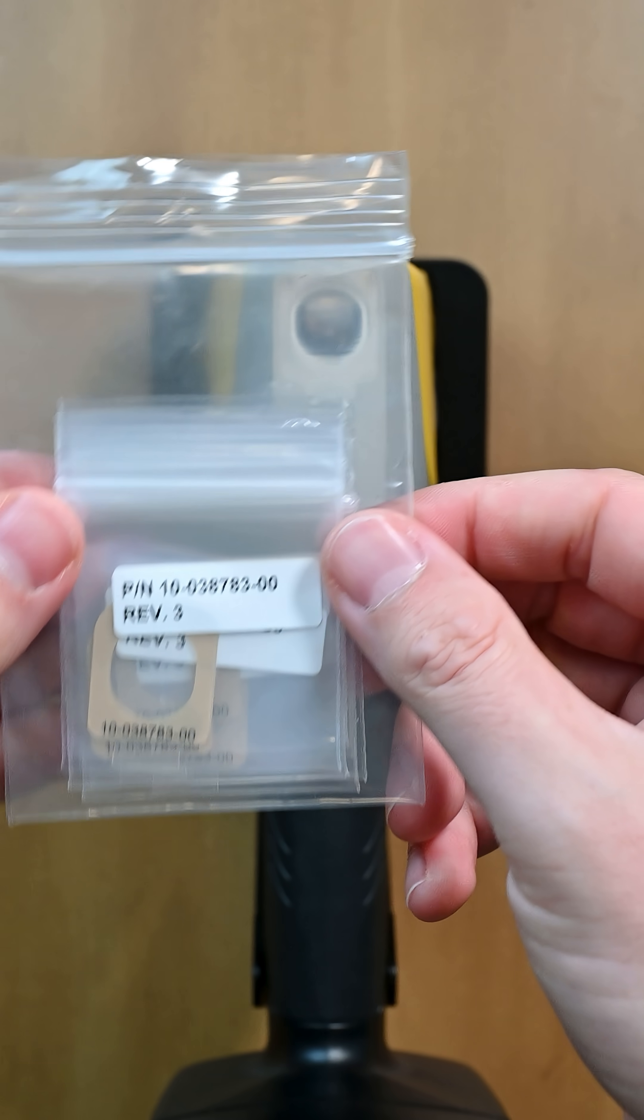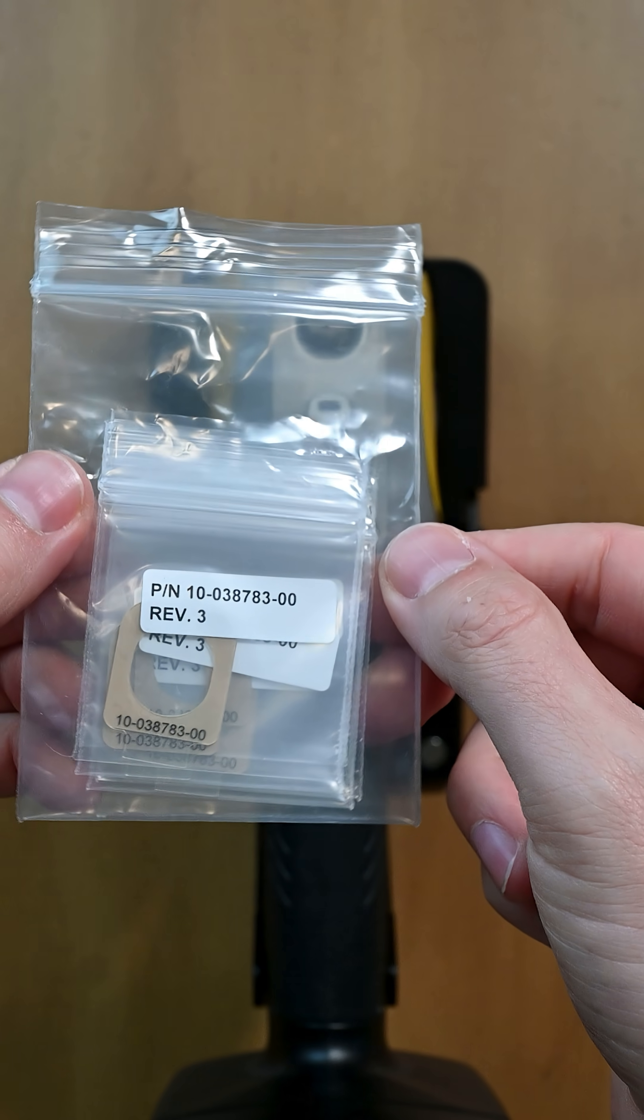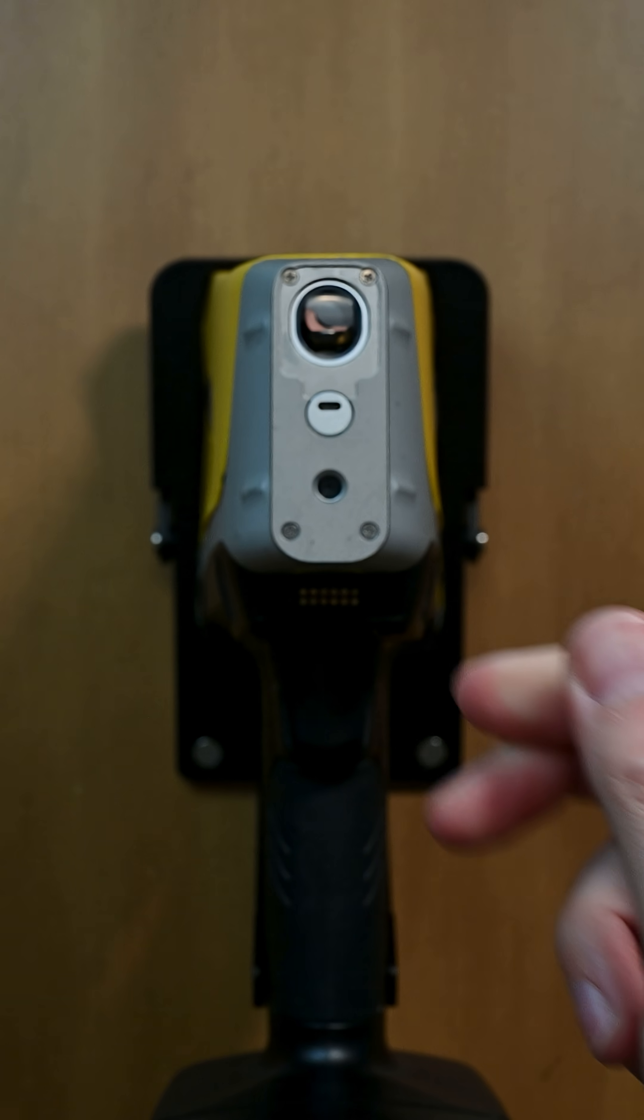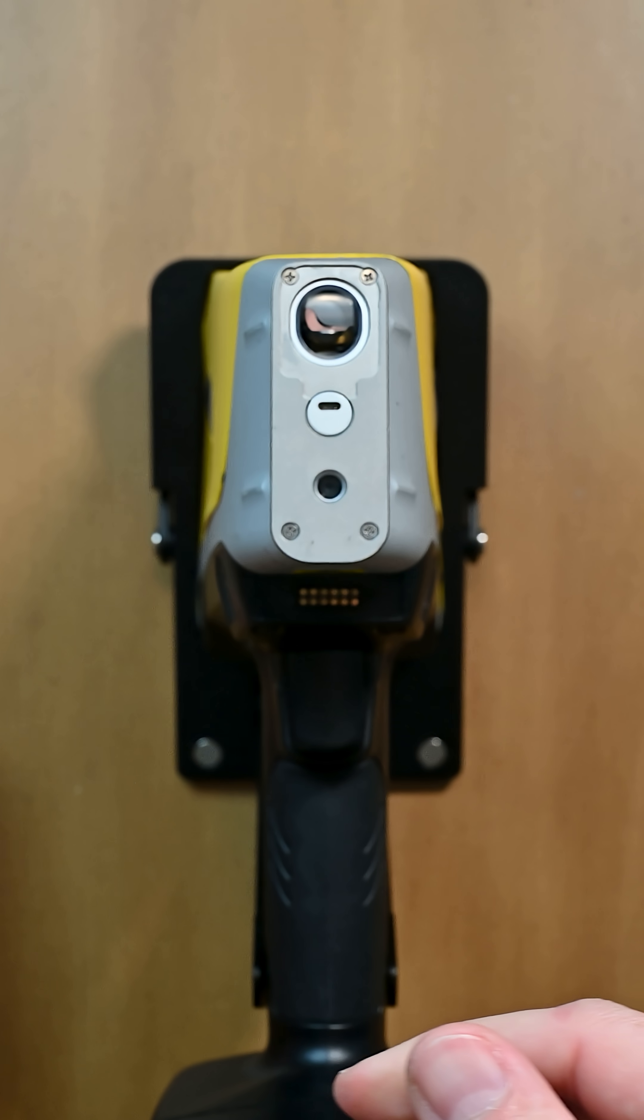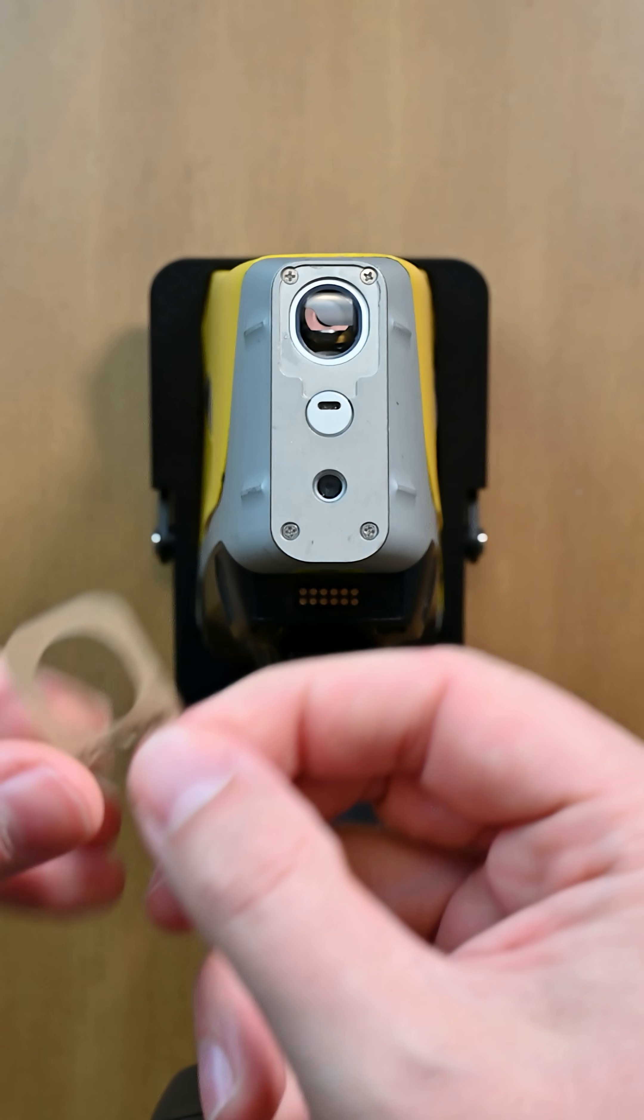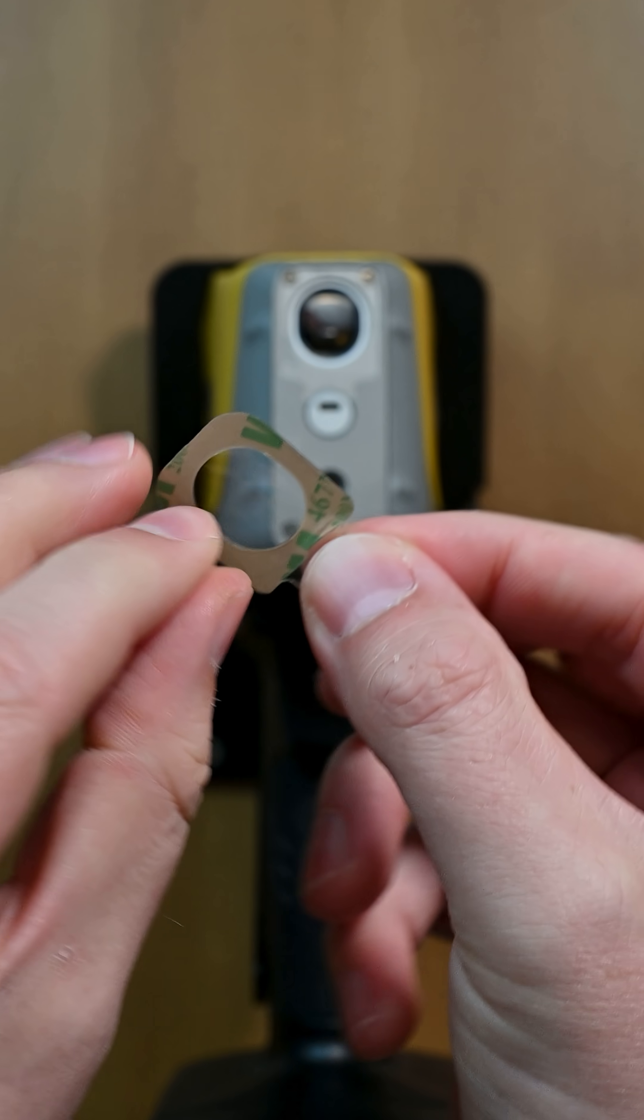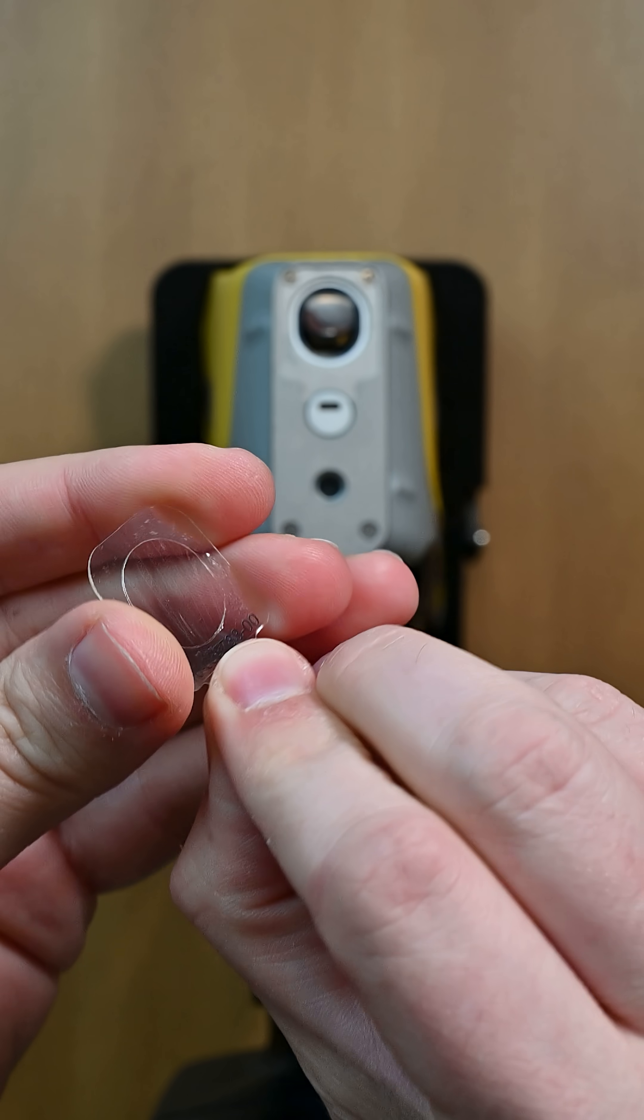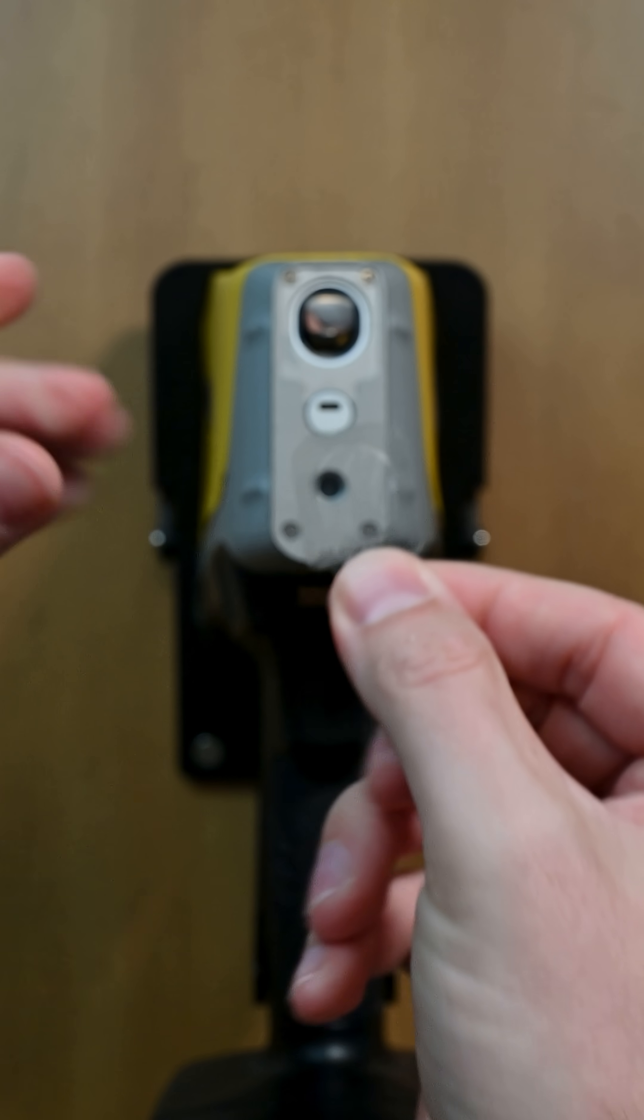Then in the case for your Vantamax, you're gonna find new windows that look like this. Just find one of those, take it out of the package, and remove the backing here, and there you go.